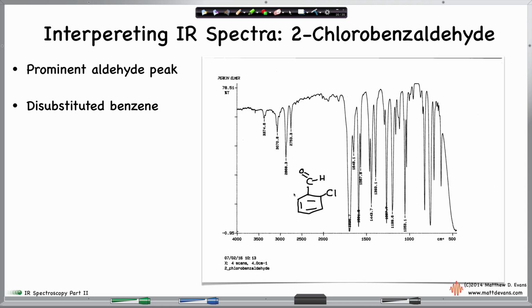So a couple things we could be looking for. First of all, the most important one is going to be the carbonyl, and we definitely see that, although it's a really strange value here. But carbonyl, here's the absorption. It's this very large absorption here. What else can we find? Benzene is part of this absorption here. If we look carefully enough, we could probably find that 1,2 substitution somewhere down in this region right here, right about there. What else? The aldehyde is going to have this right here. Ketones don't have that.